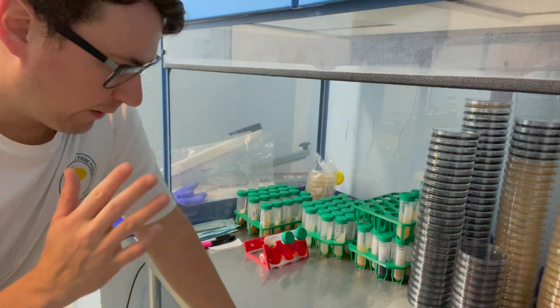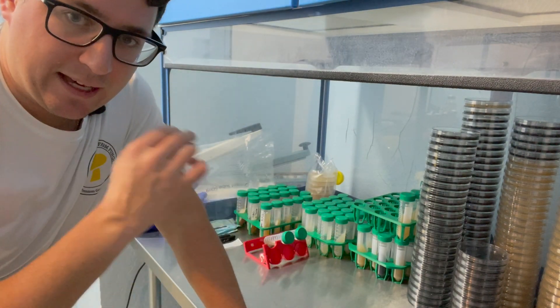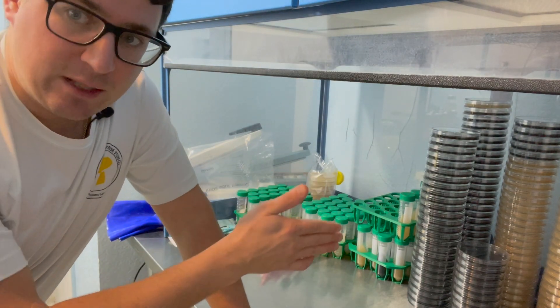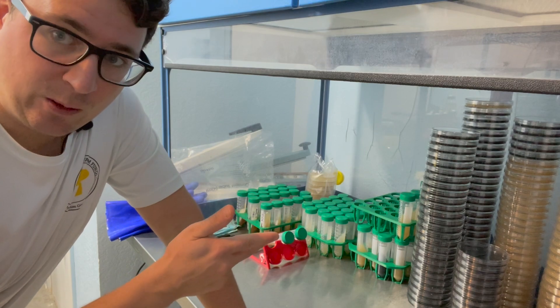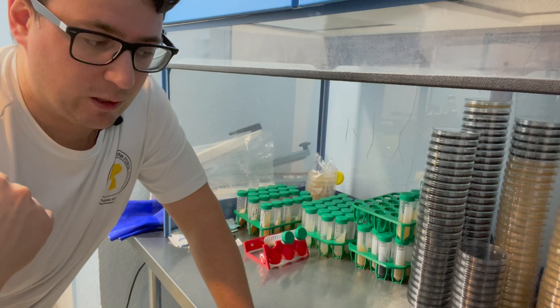Before we get started, I just wanted to point out that we poured these plates about a week ago and let them sit so that it validates that the petri dishes are in fact sterile. And then if we get contamination from the liquid culture, it's probably from the liquid culture.